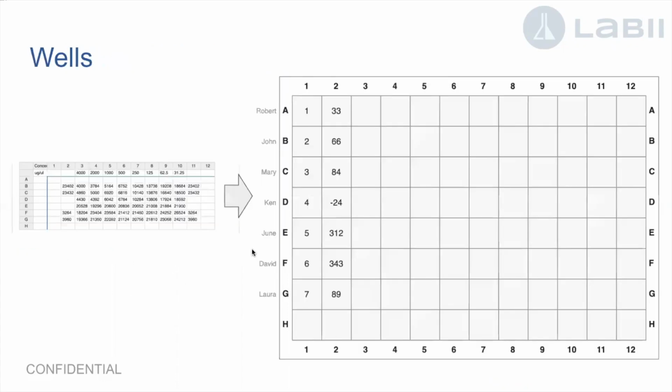And then for the wells, we also updated the layout. This is what the well looks like before. It's more like Excel, kind of familiar to what you are already using in Excel. But in the new version, it's more like a well layout. And then it will give you the labels on the sidebar and the numbers on the top.